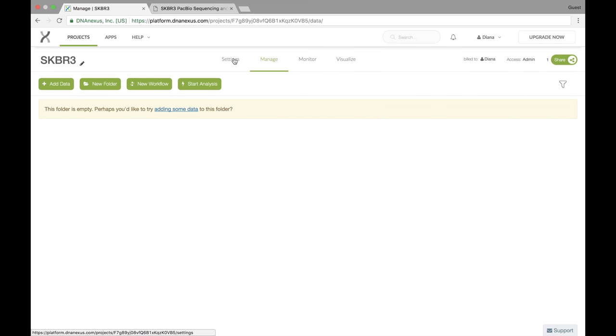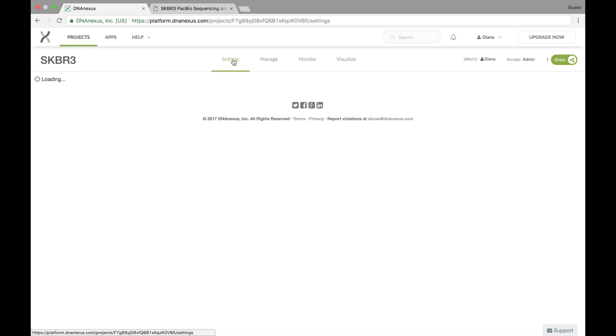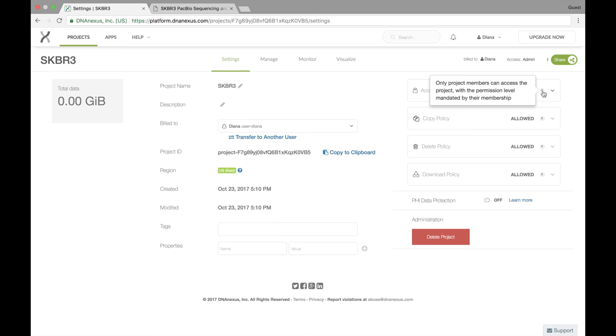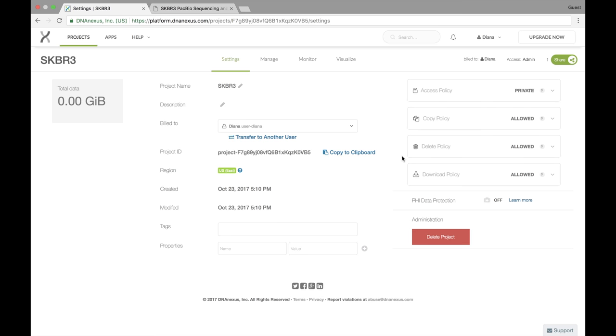Let's go take a look at the settings. In the settings, you can see all those things that you could change before we created the project as well. If you hover over the question mark, it'll tell you what these different policies mean, but they have to do with who can access the project, copy data, delete data, and download data.